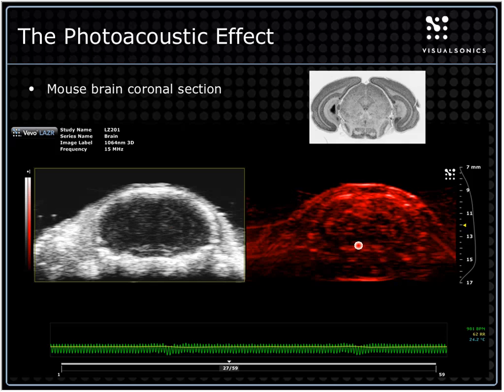Part of the reason is to get this signal, we only have to get the ultrasound out of the skull, whereas in here, we have to get the ultrasound in. It's got to be reflected and come out. In this case, we deliver the light. The sound only has to go one way, so we can be somewhat more sensitive. And we're also looking at something different where there may be minimal differences in reflection of sound. There are certainly very, very strong differences in the absorption of light. Mostly what absorbs in the body of an animal in the wavelength range that we're using is hemoglobin. So at the 680 to 970 nanometer range, we're looking primarily at hemoglobin, which allows us to see the vasculature in the brain. And you can see here clearly, we can see right down to the base of the brain and even into the internal carotid arteries.